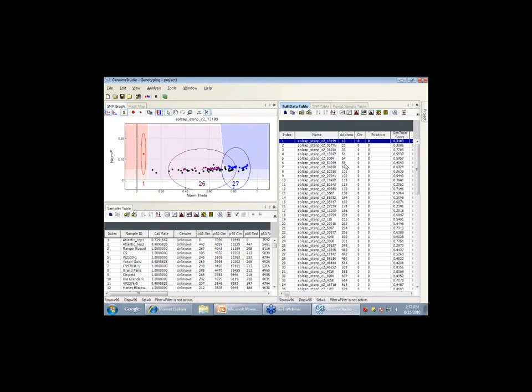So basically, this software is not fully integrated into the genome browser or any of the other SolCAP tools. This is independent software. What we've loaded is a set of SNPs. We told it what the SNPs are, and we told it what the samples are, and the software is putting together the combination of those two when we put them through the lab.